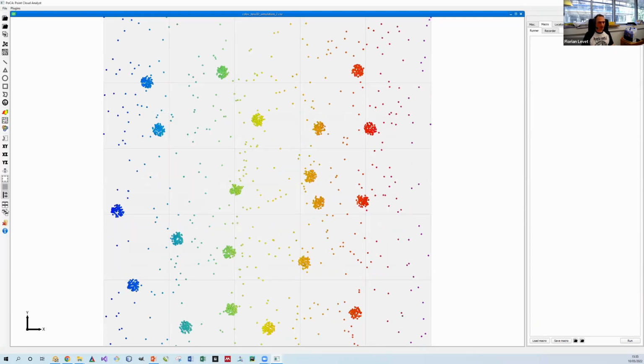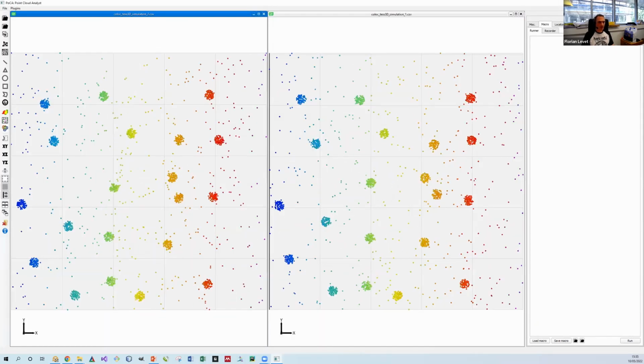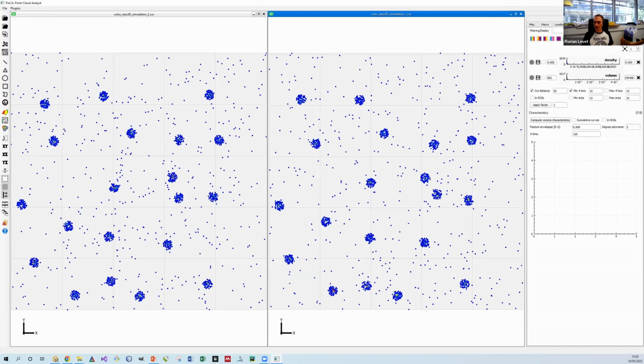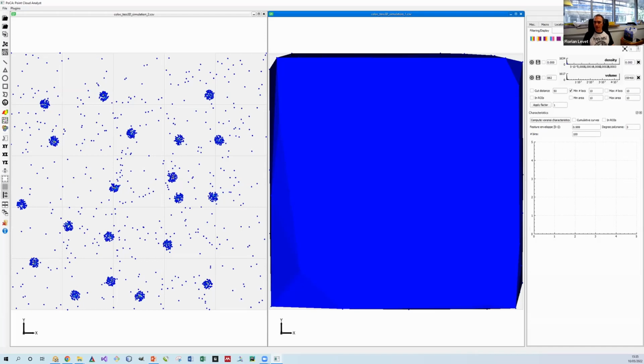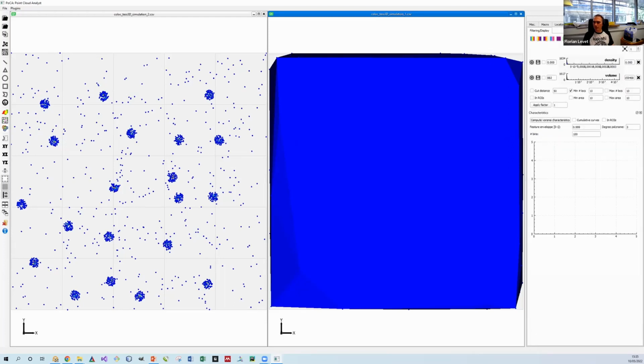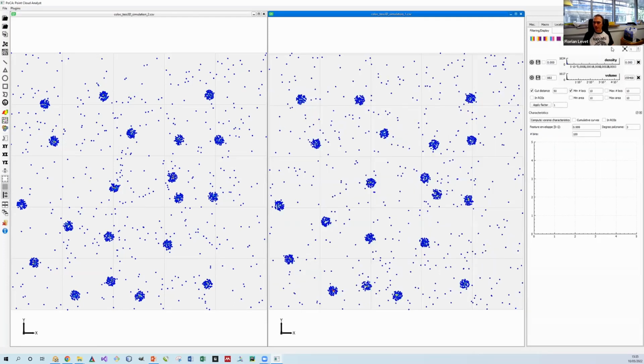Okay, I have my two data. I create Voronoï. I create Voronoï. I'm going to create now some objects. Oh, yes, okay, sorry. Okay, now it's done.